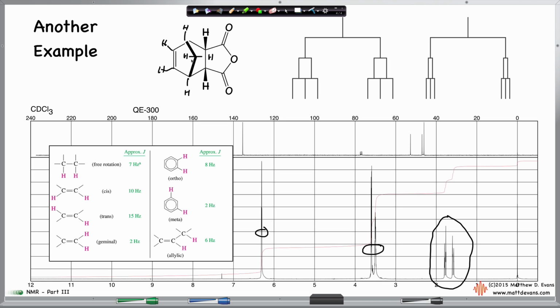And when you look at these two hydrogens closely and you ask the question, are they homotopic, enantiotopic, or diastereotopic? They are, as it turns out, diastereotopic. And usually when you've got hydrogens that are permanently fixed in different local magnetic environments, which these are, they're diastereotopic, you can get complex patterns. In fact, you're always going to see complex patterns when that's so.